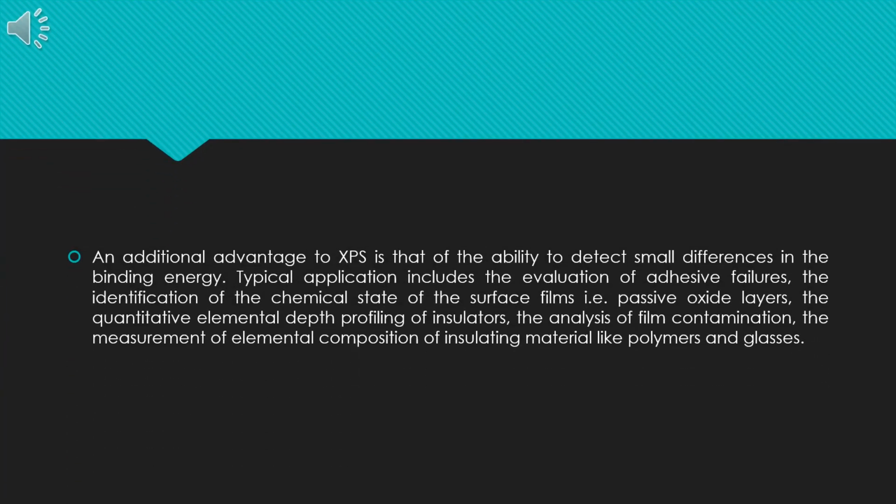An additional advantage of XPS is the ability to detect small differences in the binding energy. Typical applications include the evaluation of adhesive failure, the identification of the chemical state of the surface film, a passive oxide layer, the quantitative elemental depth profiling of insulators, the analysis of film contamination, and the measurement of elemental composition of insulating materials like polymers and glasses.